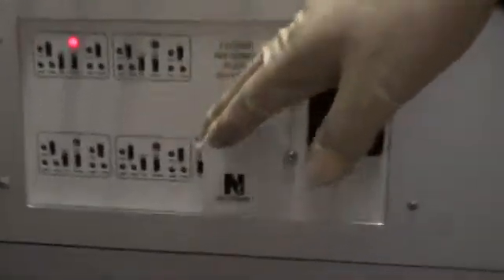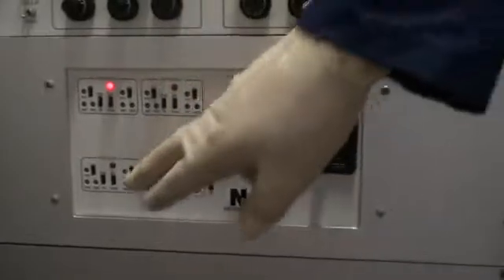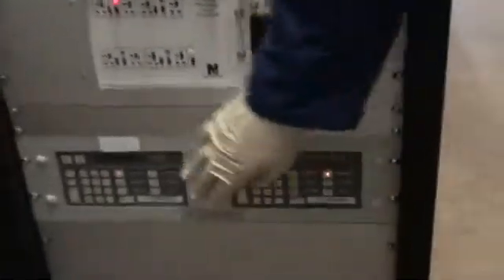This controller here is our four-pocket sweep pattern control, where we could select pocket one, two, three, and four. That is brand new as well. We have two CTI controllers — this one's for the water pump, and this one's for the cryopump.